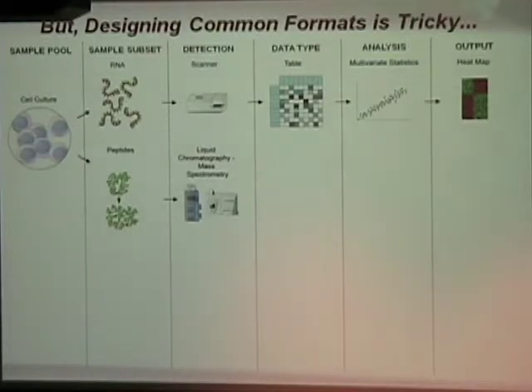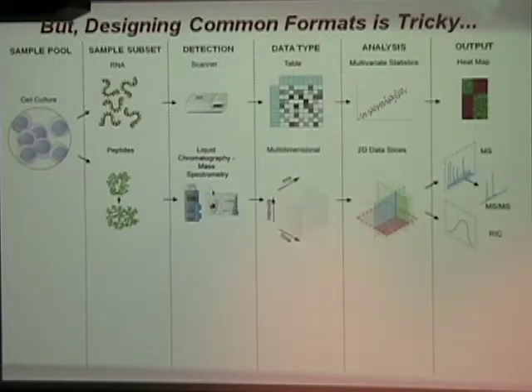The difference is that our raw output from our instrumentation is still such that we don't know how to extract everything out of it, and we don't have a finite set of answers. There's a lot more in there that needs to be looked at again and again and again. So what we're doing is a lot of re-slicing the data.